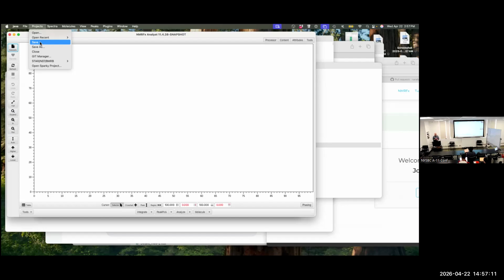There's a star folder because all the ancillary information we develop, assignments and sequences, are going to end up in a BMRB star file. There's a windows folder. If you save a project and you have like 5 windows open in different orientations, when you reload the project, you're going to see those same 5 windows with the same data sets, and that goes into this windows folder. There's a peaks folder, which gets all the peak lists written into it. Well, that's redundant with what's in the star file. When I read it, they're there, so if you want to use some other program and grep through or look for peaks and write a Python script, the files are there if you don't want to learn how to read a star file.